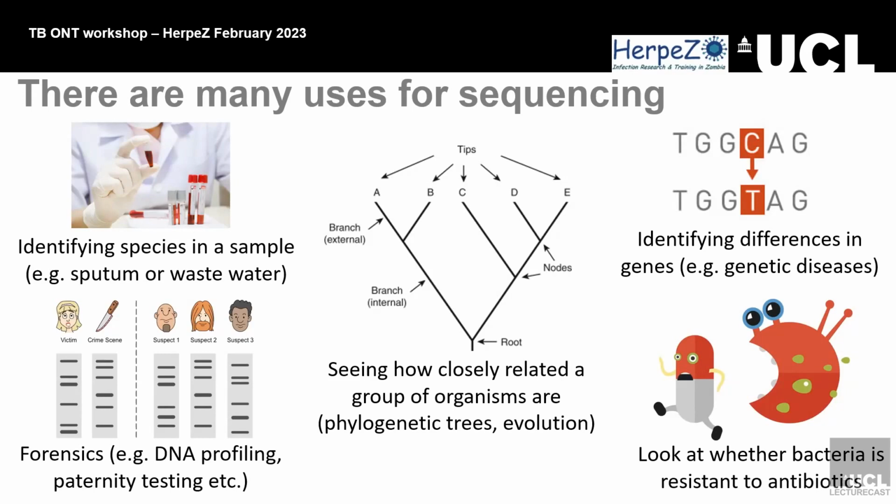It can also be used in surveillance. For example, we had the example from Dr. Solo, where he was talking about having to determine where someone has contracted a specific bug from. So you can determine whether the bug was passed on from the mother, or, if you get all the samples from the community, you can determine transmission patterns from how related the organisms are after you sequence them.